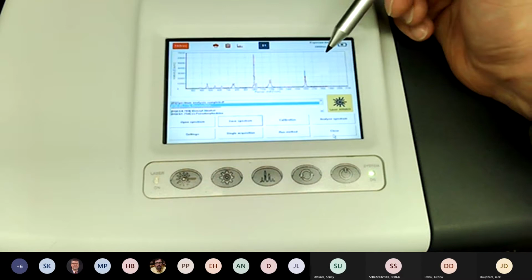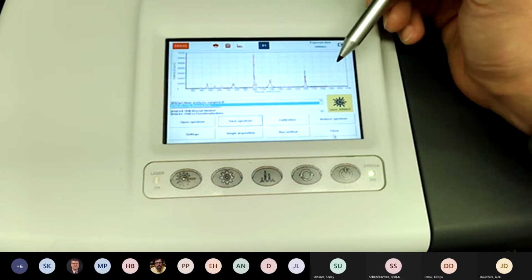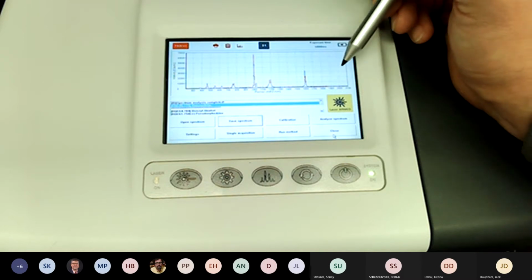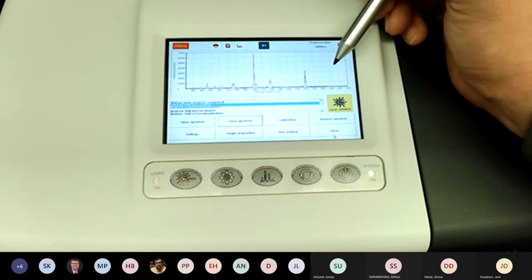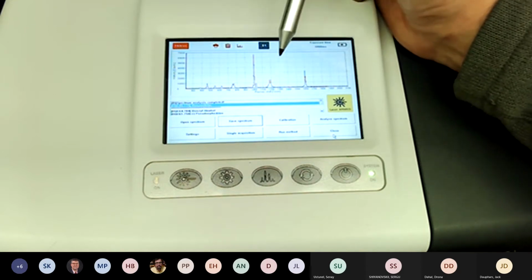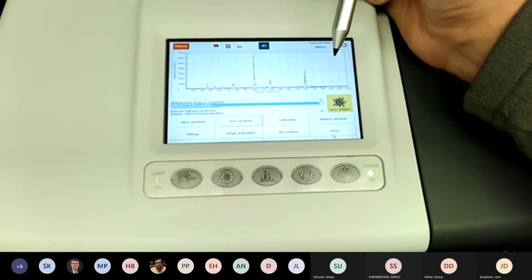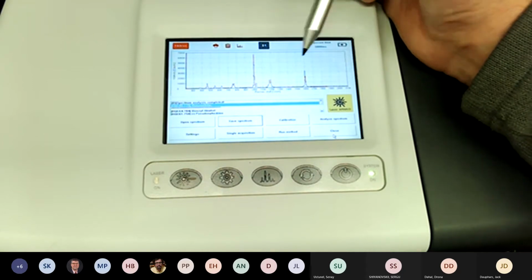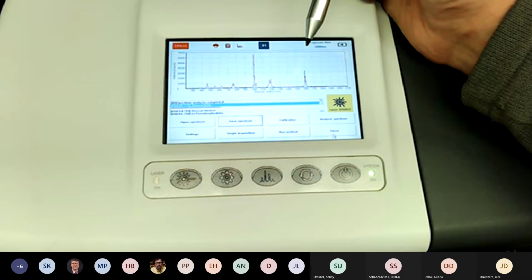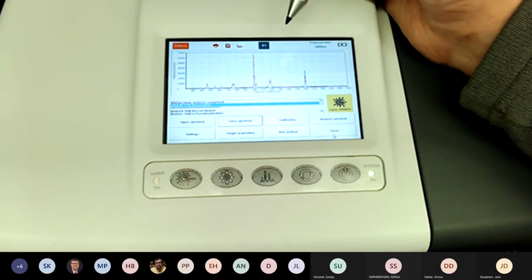The other thing to mention is if you want to make your own calibration curve on this. We just released a new generation of instrument that's got some more capabilities, but with this instrument at this time, you really need to prepare your own standards, run them, take the data off of here to Excel, and then build your own calibration curve. Then you'll have your equation that you'll need to use to back-calculate when you run unknown samples. That's really the easiest way to do it as of right now, to set those factors in Excel and run them that way.